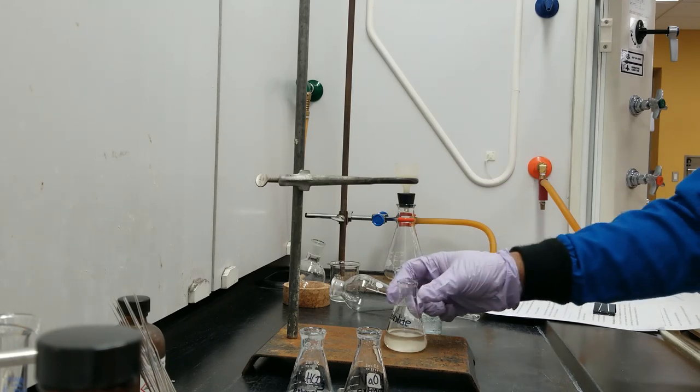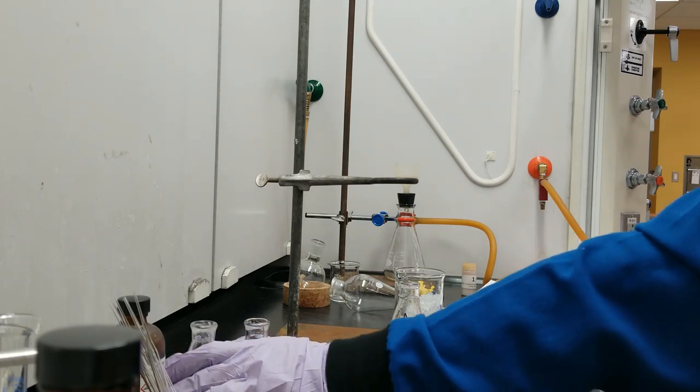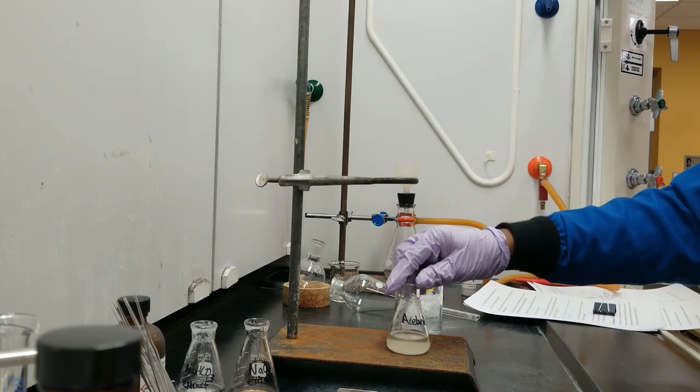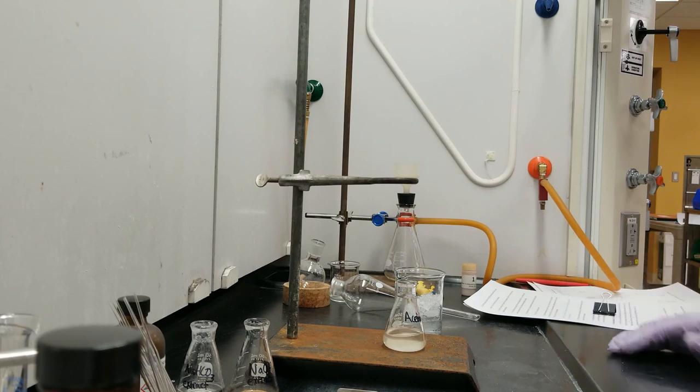Next part is to work with the organic layer, that is the acetanilide solution in diethyl ether, because as we know, the organic solvents are pretty volatile, so we cannot keep them for a long time. So we will use this liquid at first. We will isolate acetanilide from the mixture.